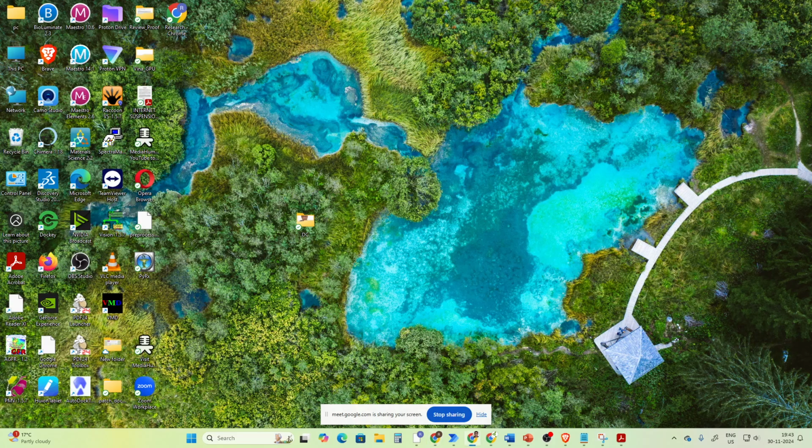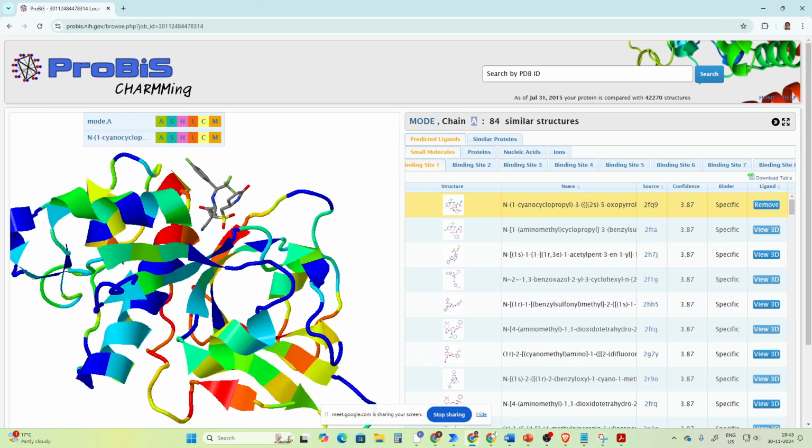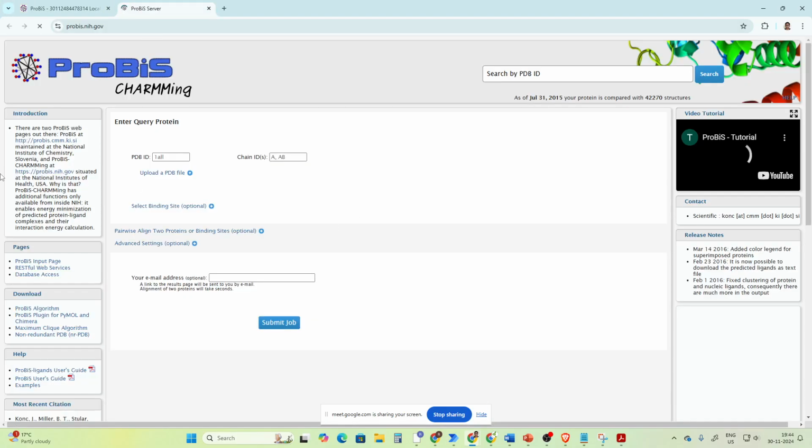I'll just show you how ProBiS works. So this is the result of ProBiS, and it looks something like this.